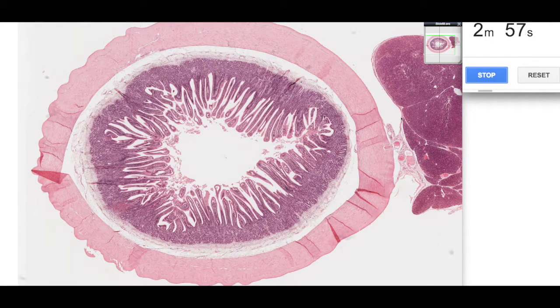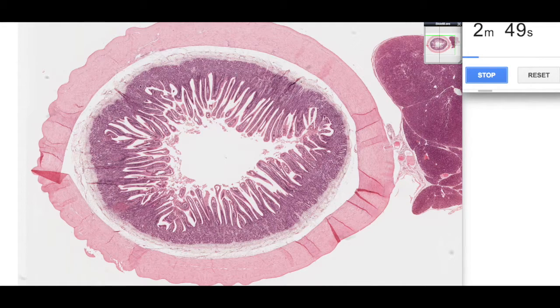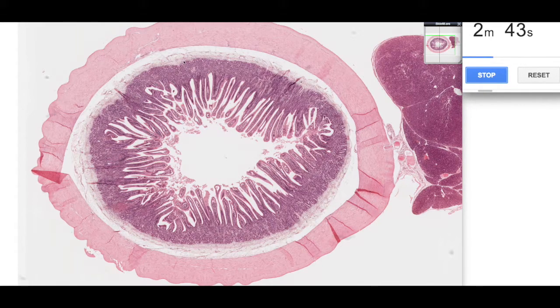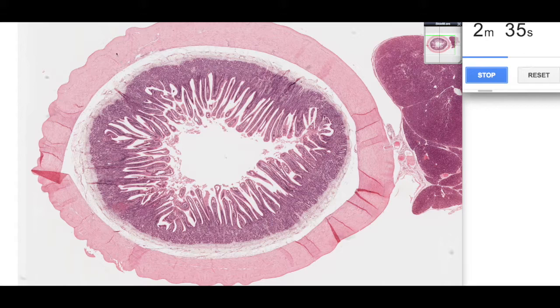The thing that really sticks out from this section are these finger-like projections — these are villi, extensions of the mucosa. We've got this big purple or basophilic band representing the epithelium, our lining epithelium and our glands, then the paler region which is the submucosa, and then this very acidophilic band on the outside which is our tunica muscularis.